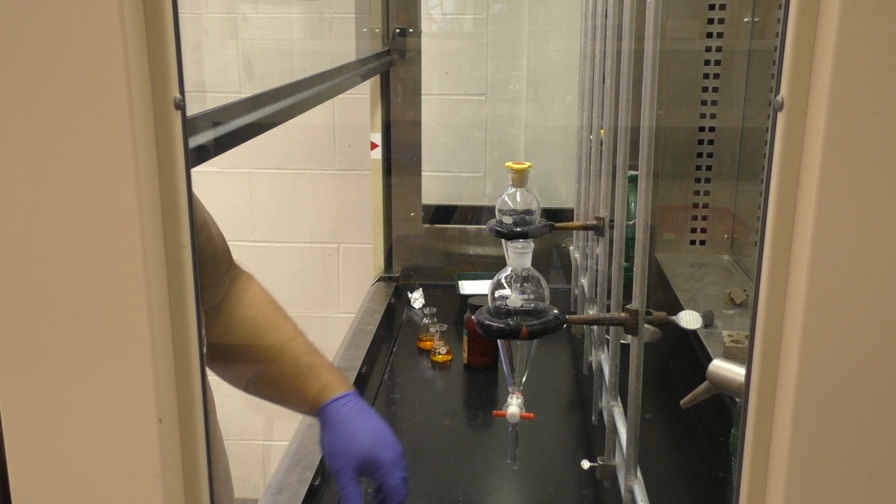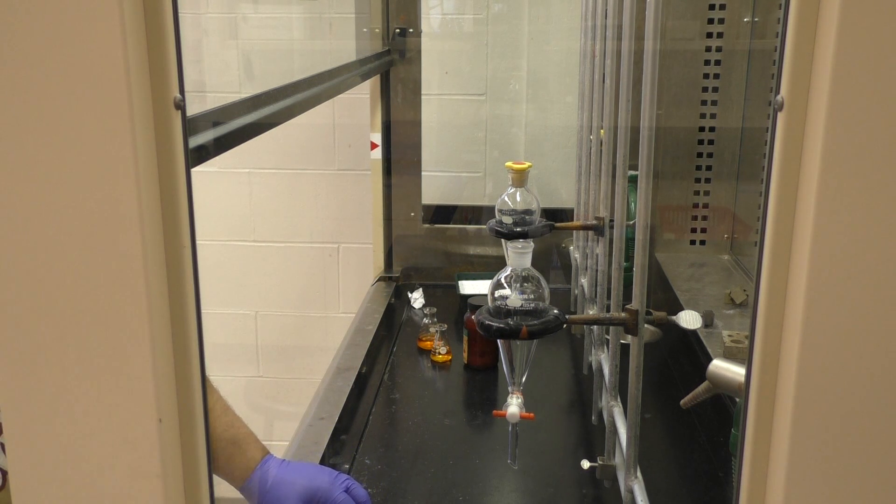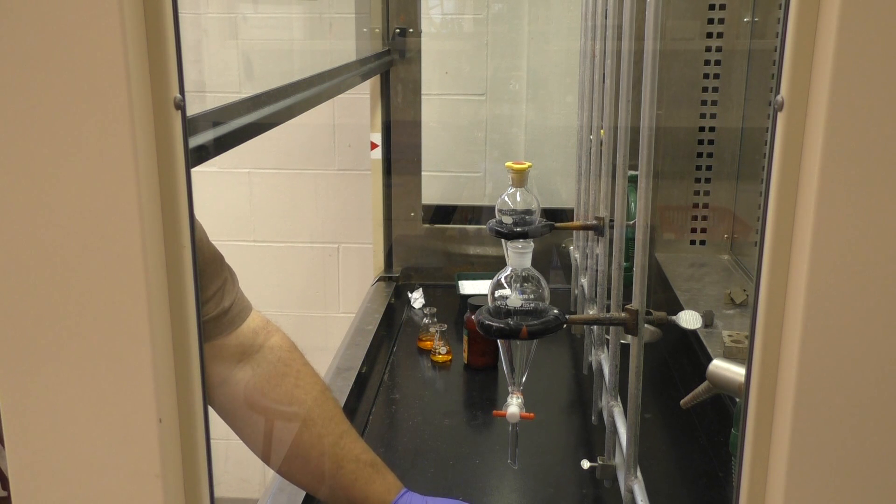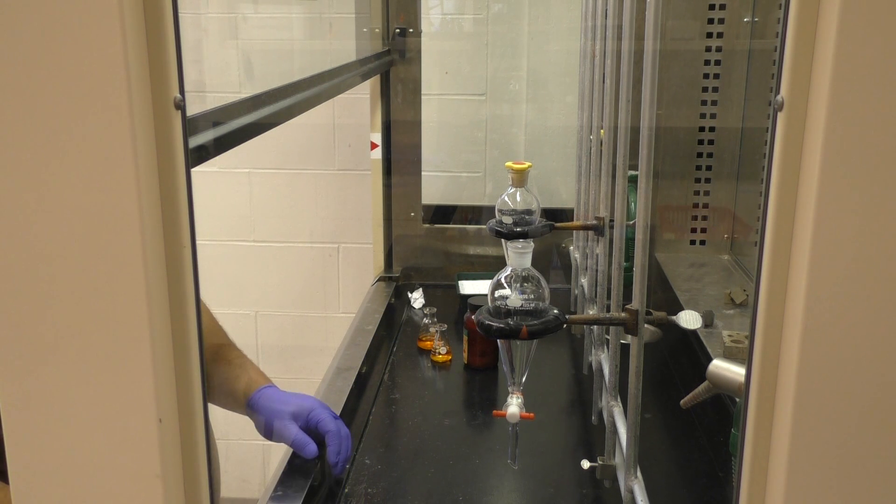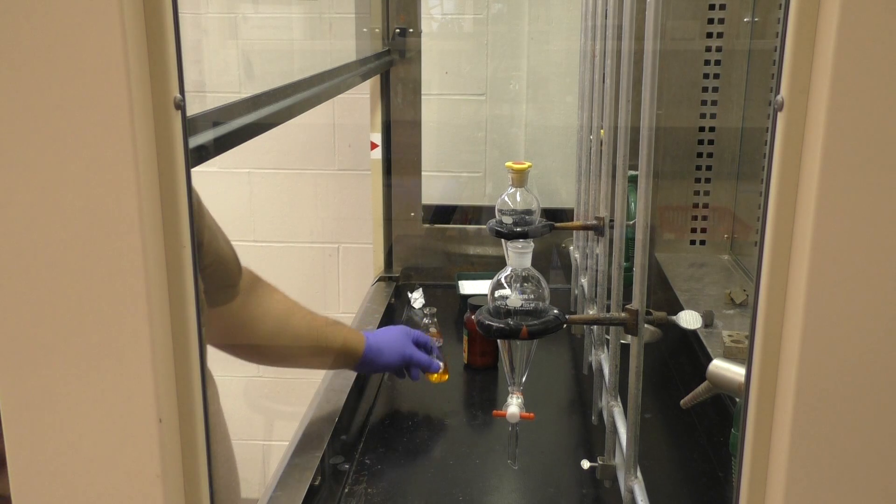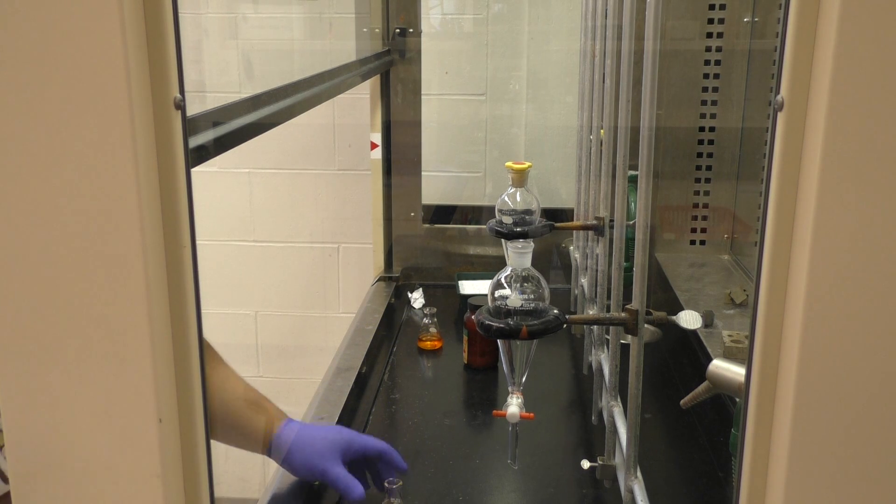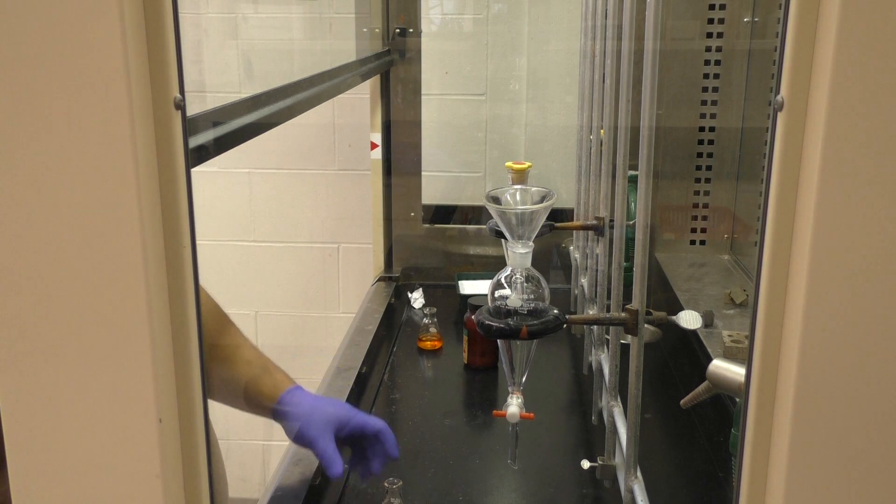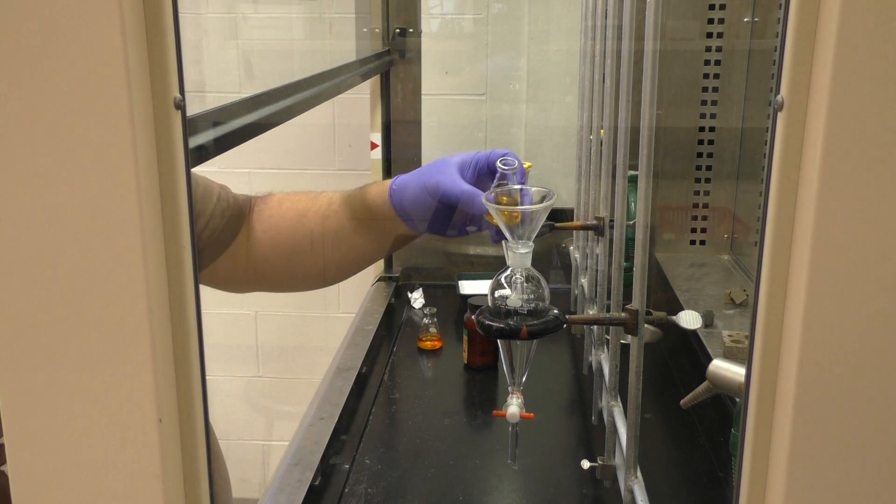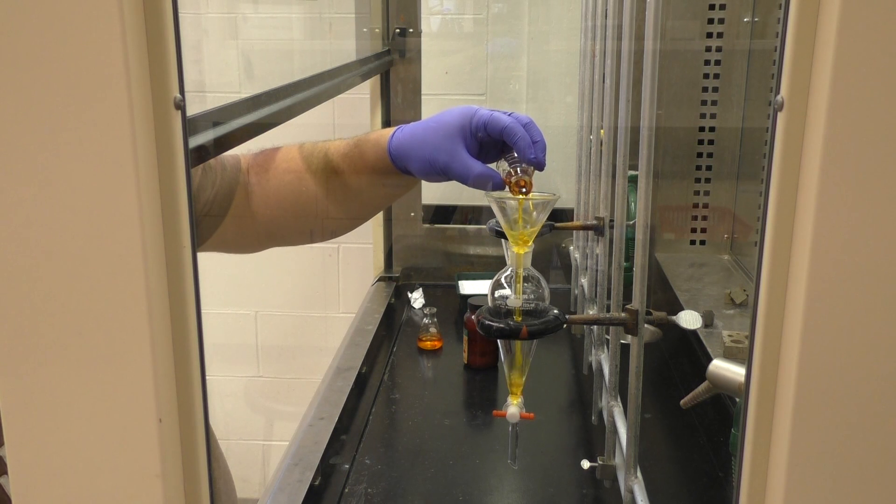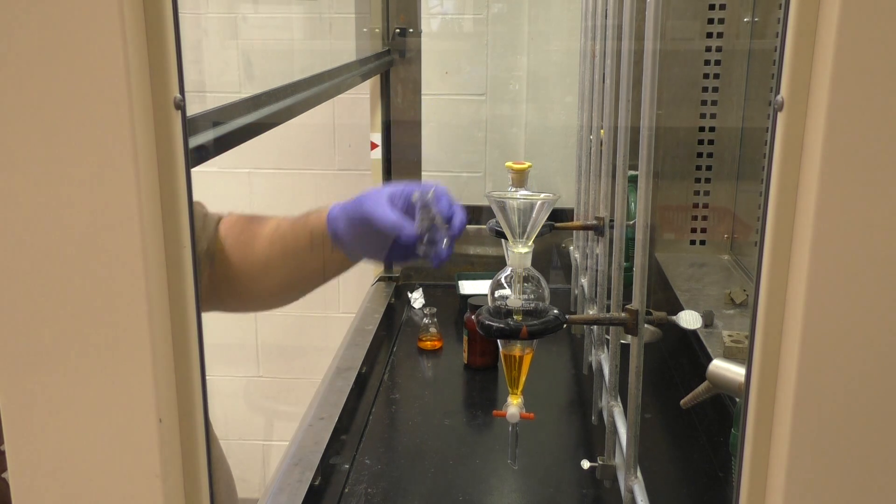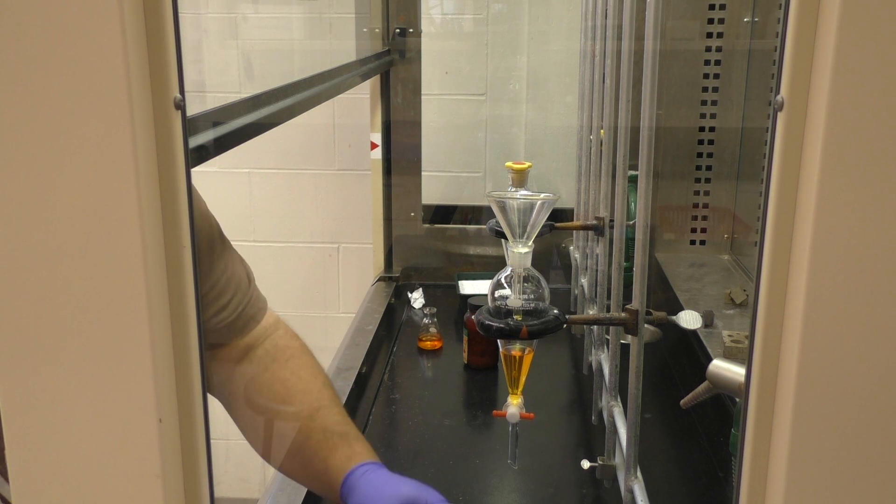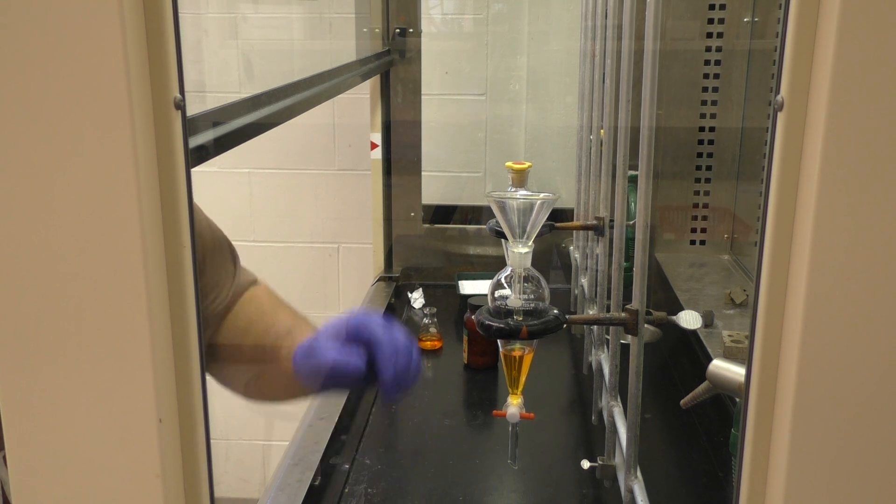You're going to need some glassware, beakers, or Erlenmeyer's to, on the one hand, collect the stuff, but then also to pour the material in. And you can use the glass stem funnel to help prevent spilling. And in this case, for this video, I've got an organic dye, or a chromophore, and we've dissolved it into an organic solvent.